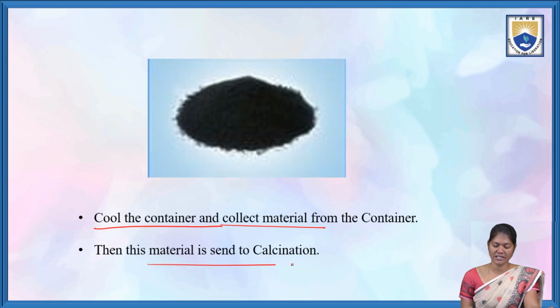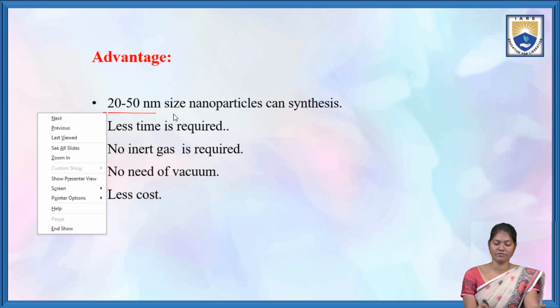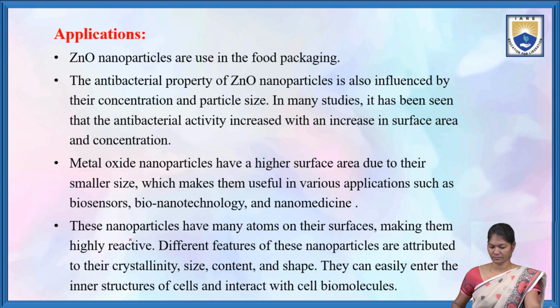Then this material is sent to calcination. In this method, we have some advantages: nanoparticles of 20 to 50 nanometer size can be synthesized, and less time is required. No inert gas is required, no need of vacuum, and it is low cost.